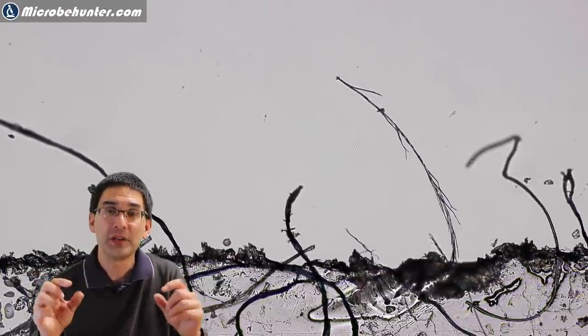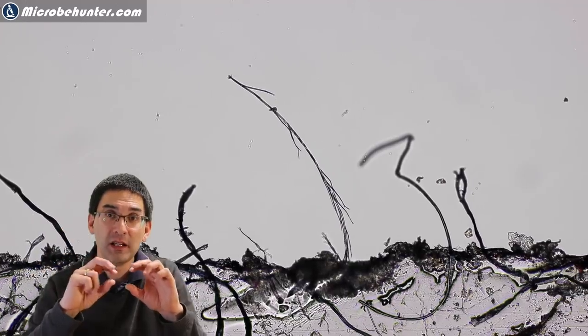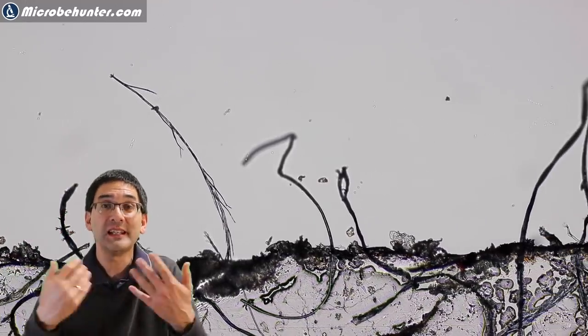This picture here now I've used my compound microscope and here you can again see that the image clarity and the image quality is yet a little bit higher.